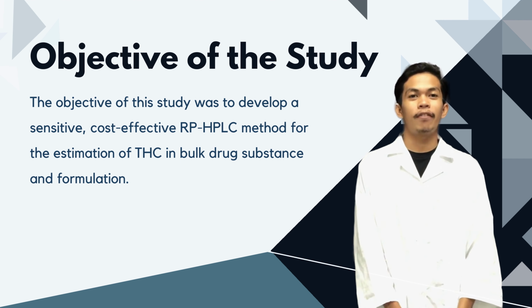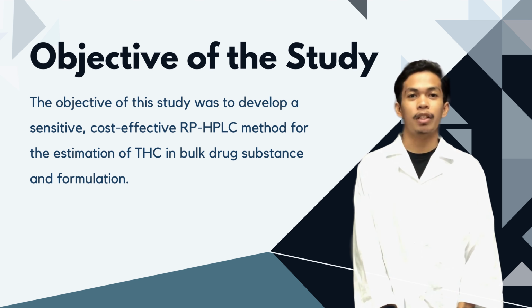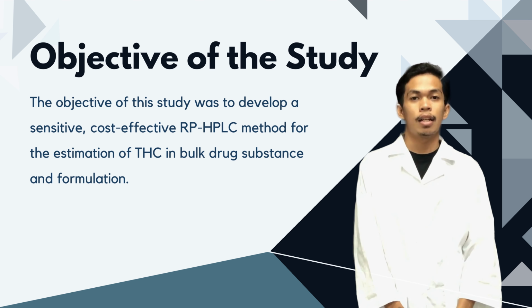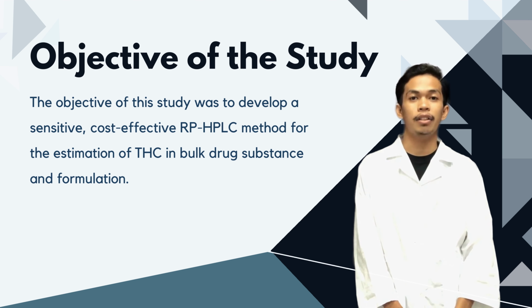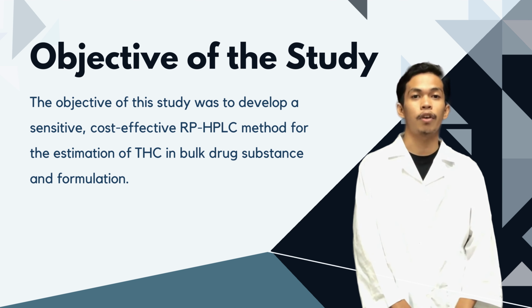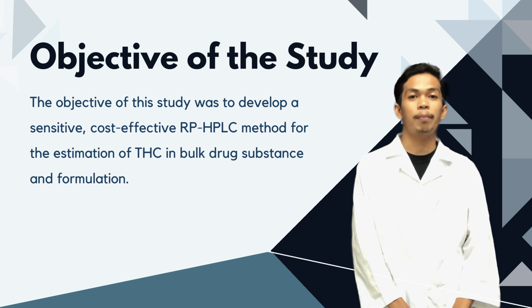By developing a validated HPLC method for the quantification of THC, the study aimed to provide a valuable tool for the quality control analysis of THC in bulk drug and formulation. The main objective of this study was to develop a reliable and accurate method for the quantification of THC in bulk drug and formulation using high-performance liquid chromatography analysis.